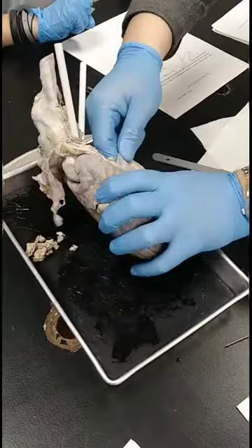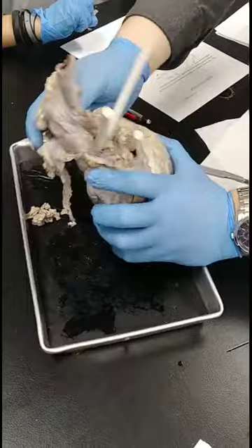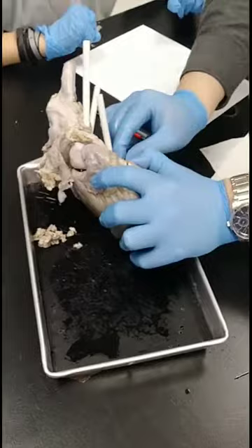Here's another blood vessel. Use another probe. Get that marked. And when you open this up, you can see where these are going. Here's the vena cava right here. Because it's not connected to the pulmonary trunk, it's going into the heart.